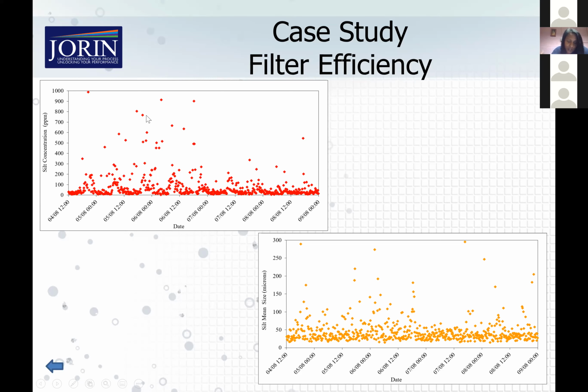So this was actually in summer. This is somewhere in the UK. So we're looking at a date in August. So it's nice summer weather on the beach. There were people out at the weekend with jet skis and little boats, and they were churning up the actual beach, and more silt was coming through. So these were much, much higher. The filters that they were speccing was nowhere near that level of loading, because I guess it just wasn't something they were expecting to see.